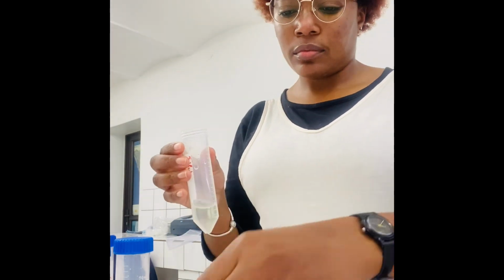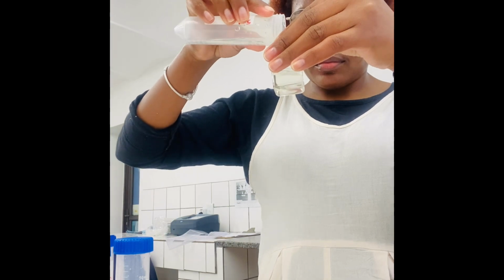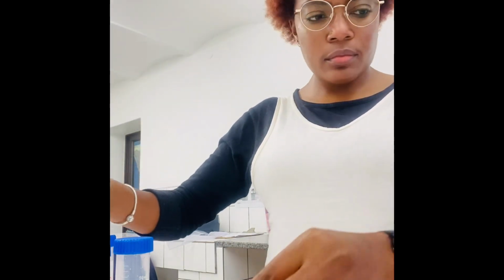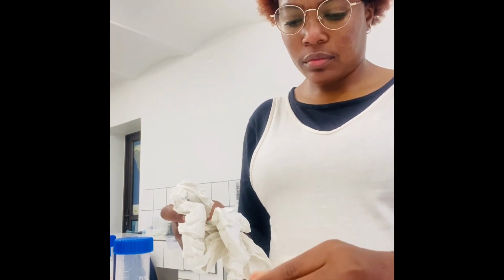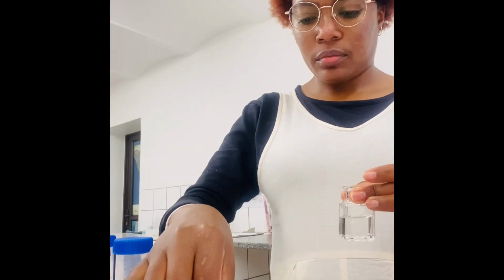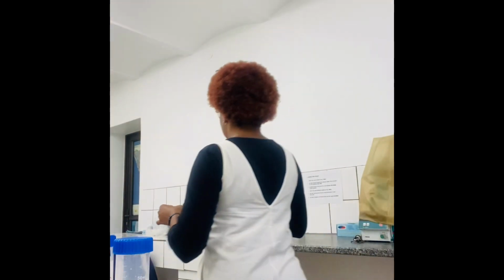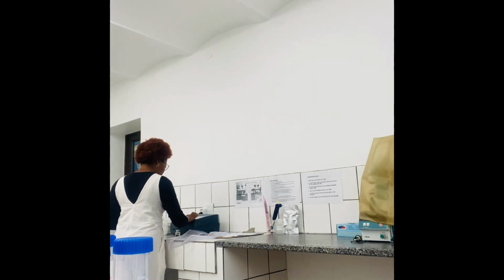Like for example, nitrate, you will find it at 0.02. I think the highest was maybe 0.09. I think that was the highest ever. So if it gives you, let's say 2, 3, then something is definitely wrong with your sample, and you have to redo it.